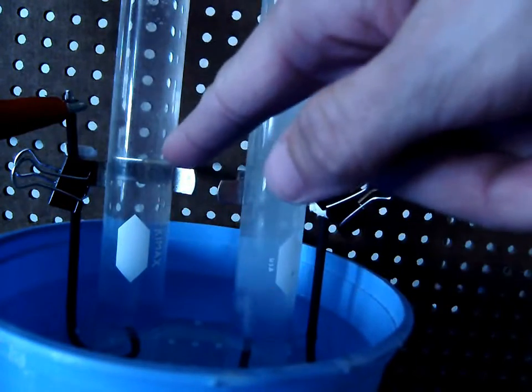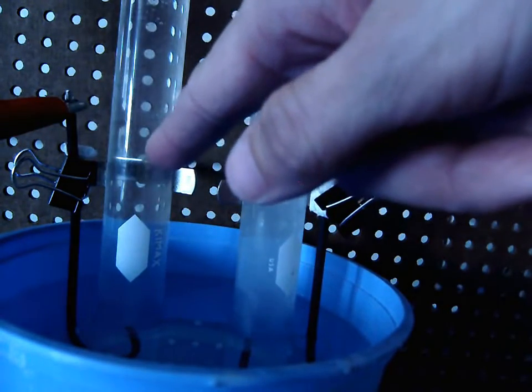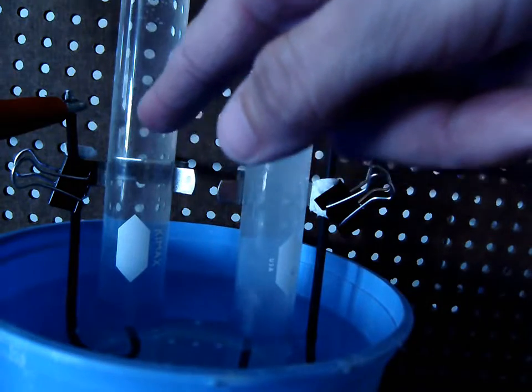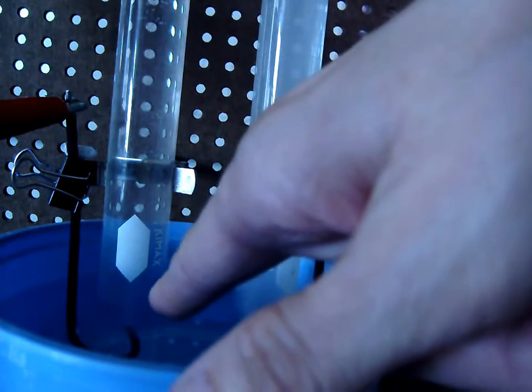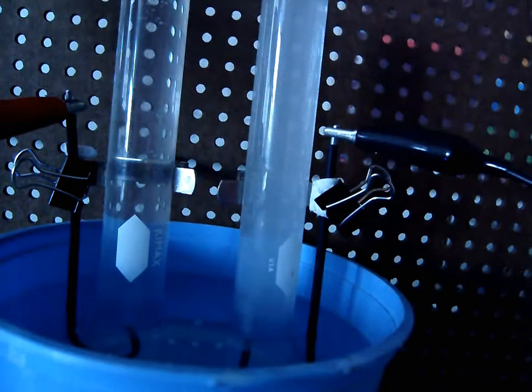Now, this cord over here, the red one, is generating a positive charge. So the element that is negatively charged is going to be attracted to that positively charged electrode, and therefore generating this gas.